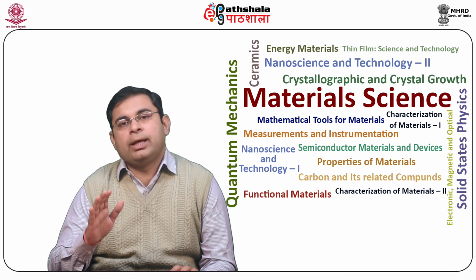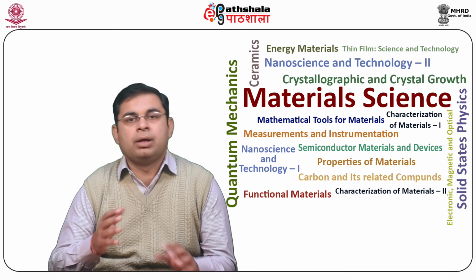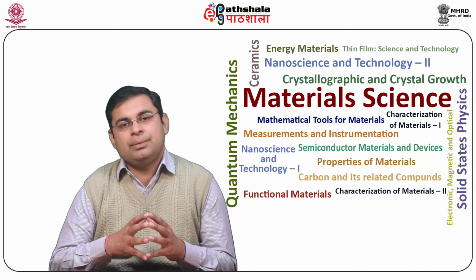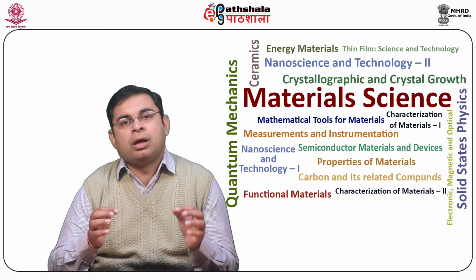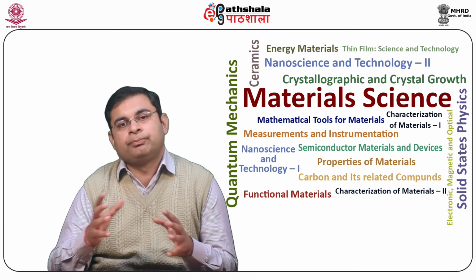CHAs include an input lens and hemispherical analyzer and are commonplace in XPS energy analyzers. CMA and CHA are band pass filters (BPF), while RFA is a high pass filter.